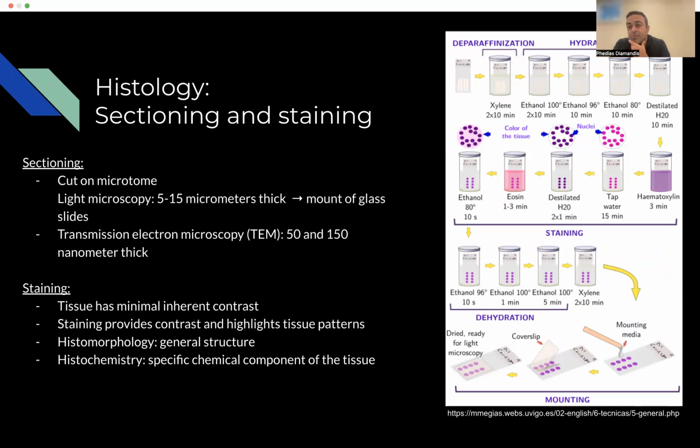Differentiation is washing it in water, which also removes some of the stain. So what you're doing is improving the selectivity of what's being stained. There are progressive and regressive types of staining protocols. When you're removing stain through this washing process, it's called a regressive stain, because you're regressing the amount of stain to improve the specificity.